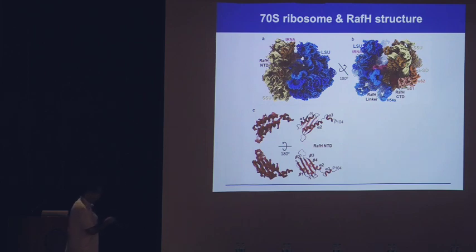Okay. So this is what NTD looks like, if we take this, you could clearly see the secondary structure features. See, resolution reporting, one thing: if you say 3 angstrom, if you don't see side chains, it means that's not true, it is something like overfitting. You could clearly see secondary structure features, alpha helix, beta sheet, separated beta sheet. Okay, this gives the confidence that what you are reporting is right.